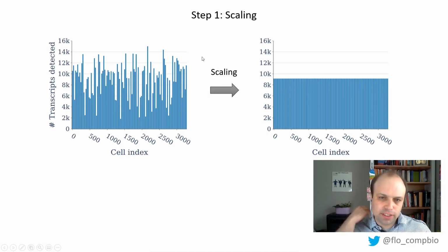And the purpose of that is twofold. First of all, you often have completely different cell types in a single-cell RNA-Seq experiment, and different cell types can have different amounts of mRNA in them. Some cells are larger and have more mRNA, others have less, and so the number of transcripts detected depends on how much RNA is available in the cell to begin with.